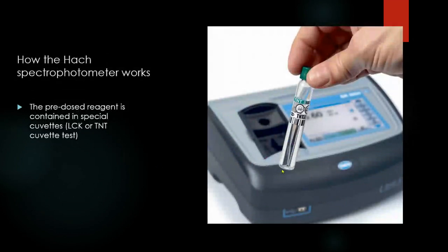This is how it physically works. We work with the cuvette test. In this cuvette test we have pre-dosed reagent. There is a liquid reagent inside the cuvette, or sometimes it is a powder.